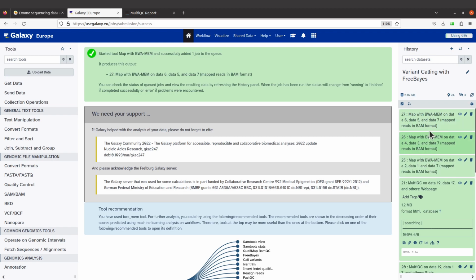Now you notice that the outputs are given numbers. But you can also rename them in case you want to keep track of the files. Maybe the numbers are confusing you, or maybe the text is confusing you. You can rename the outputs with the appropriate names or with the names of your choice. Let me put it that way. But for this tutorial, I'll skip them. I'll just use the numbers. So these are the samples. But I think it's better we rename it so that beginners don't get confused.